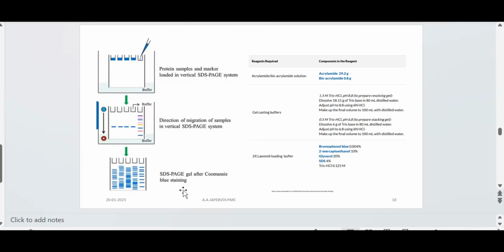The very first thing is the gel matrix. How to prepare gel, we have discussed in the previous lecture in detail, including ionic strength, pH, concentration of acrylamide, bisacrylamide, etc. And here is the summary of that, just to reconnect. So acrylamide, bisacrylamide solution, when you are talking about, they are taken in specific concentrations so that polymerization would occur and the pore size can be governed.